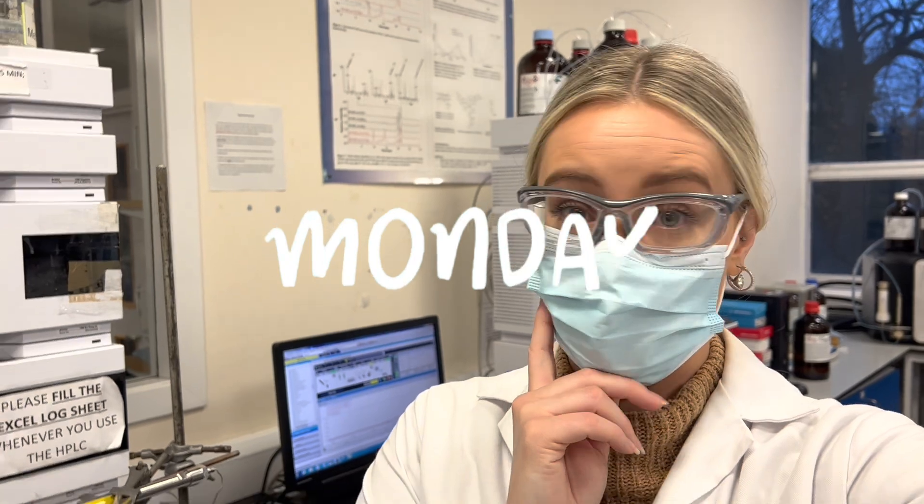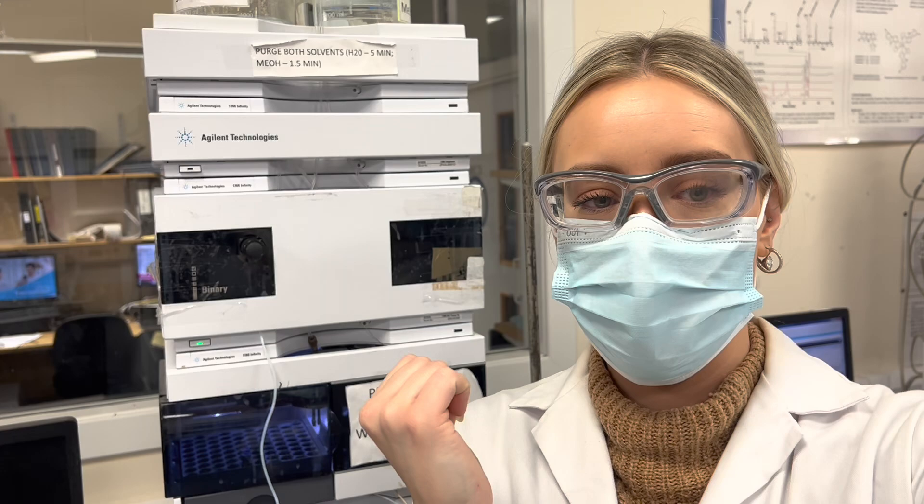Hello, good morning. It is Monday, it is miserable outside — it's so dark, it's so cold, so naturally I'm feeling tired. Anyway, today I am working on the HPLC. I'm going to be purifying a sample and I'm going to take you guys along with me and show you the process, if I don't get too shy speaking in front of my lab colleagues. So let's get started preparing the mobile phases for the HPLC.